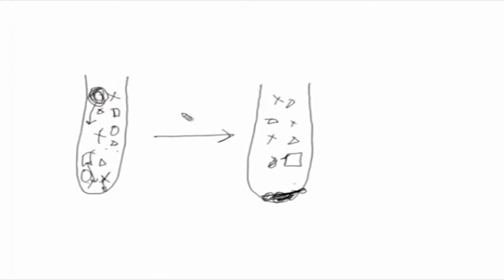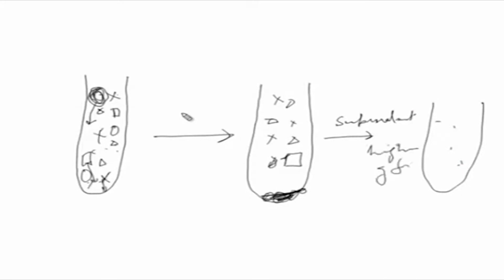So, what is done to purify is you take the supernatant into the next tube, you can decant it, and again the centrifugation will be done at higher G force, like say 10,000 G or whatever it is. Likewise, you will take this pellet also and homogenize it again in a suitable solvent solution or medium.